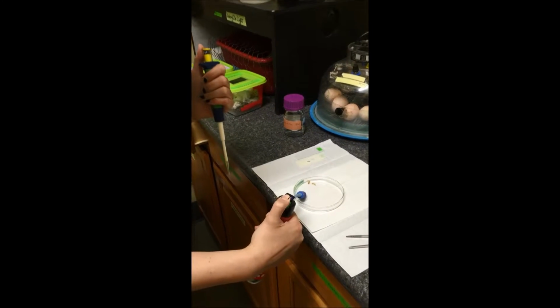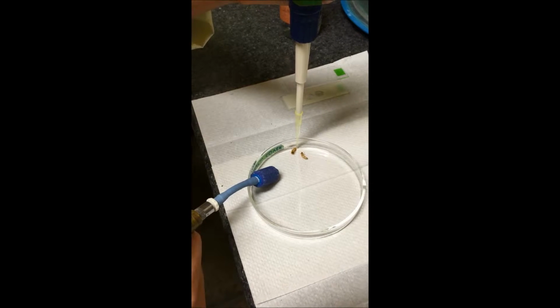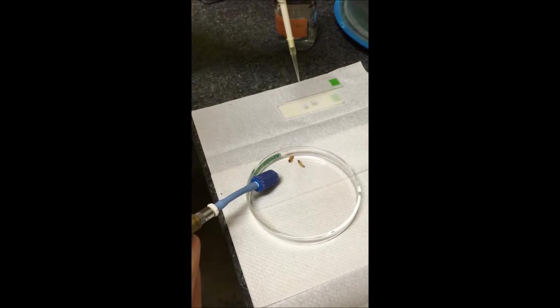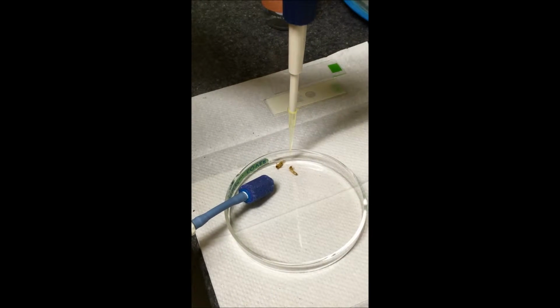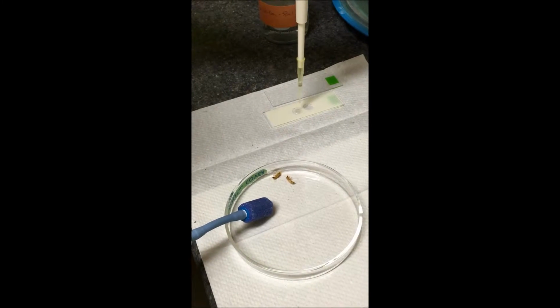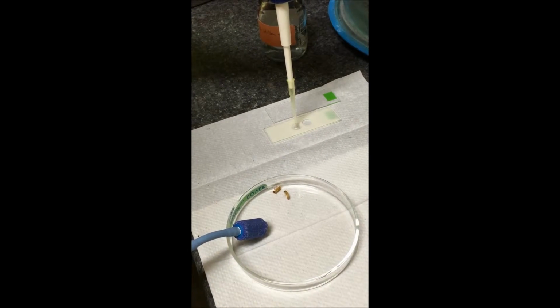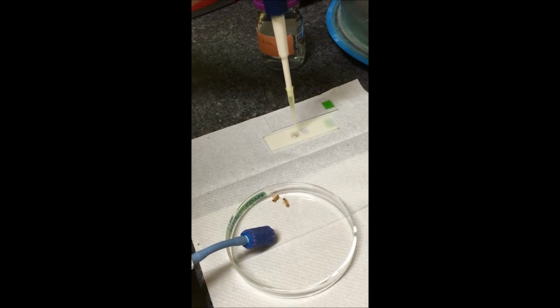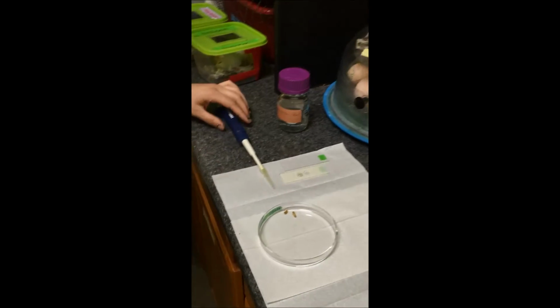There's no really good way to, there we go. And then we use a pipette to suck up the poop, put it into the slide, kind of pipette up and down a little bit to mix it all up. And then, nope, you're gonna stay under. There we go. And this guy. Alright. And it looks like they've done their business.